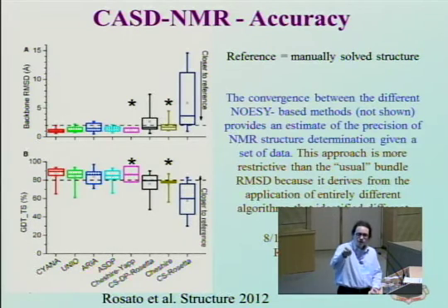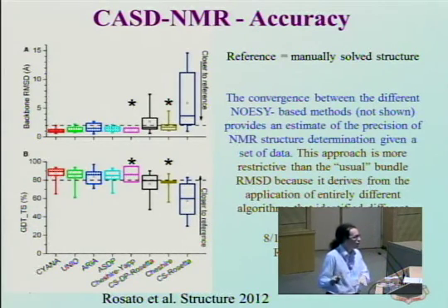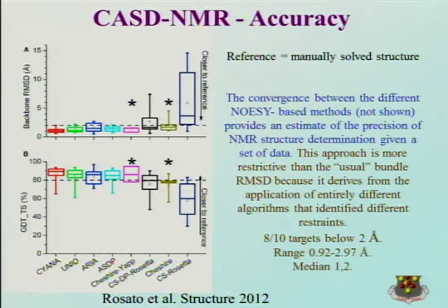So you see some of the programs do very well, and some of the programs are actually relatively poor. And this is chemical shift Rosetta, which is one of these programs that is using only chemical shift data. It doesn't use NOE data. So the first 4 programs use NOE and Talos predictions to calculate the structure. These other 2 programs use a combination of chemical shift predictions first to get initial structural models, and then they filter them based on the agreement with NOE data.